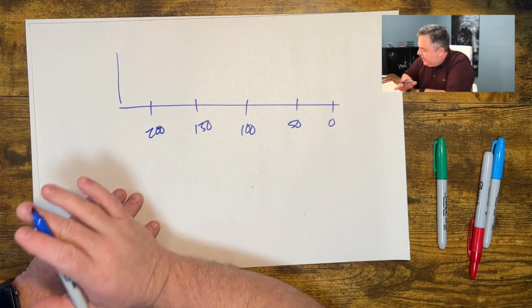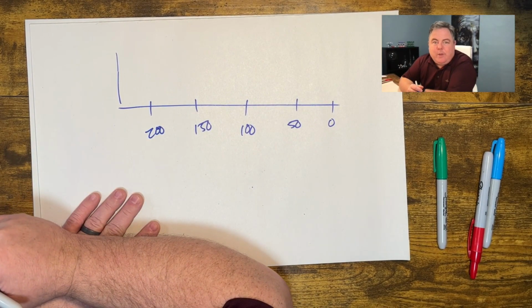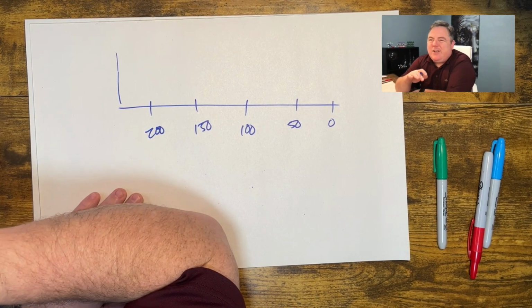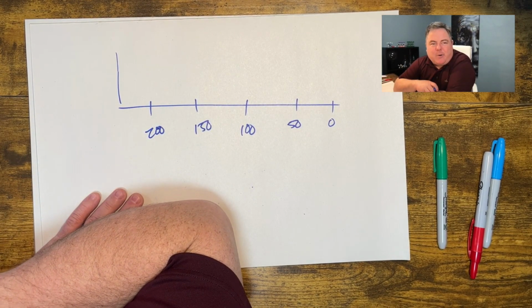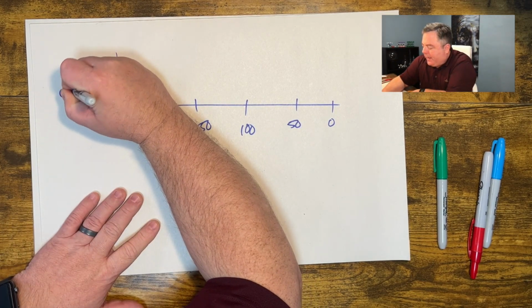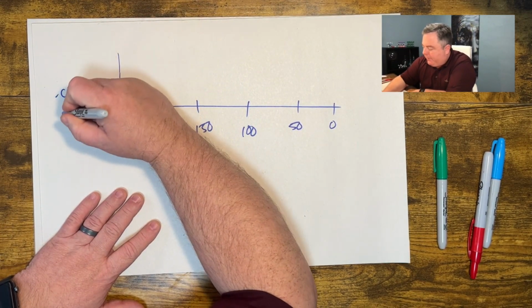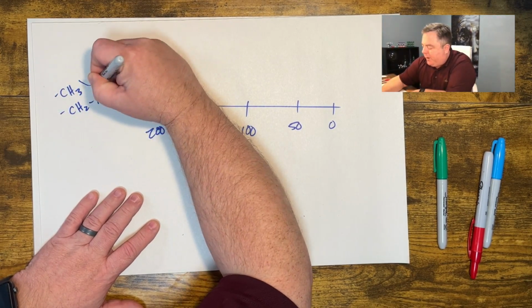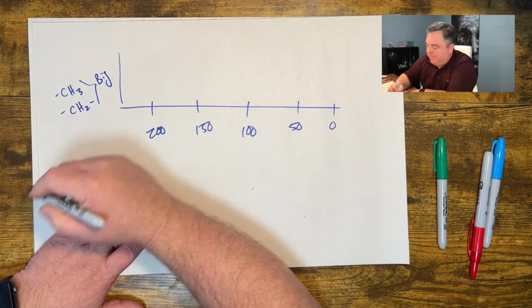The other thing about carbon NMRs, I guess you should know, is that the integral, how many carbons it represents, you have to be very careful with carbon NMR. We don't usually look at the integrals. Instead, carbons that have a lot of hydrogens on them, like methyls or CH2s, those carbons tend to be pretty big in my carbon NMR.